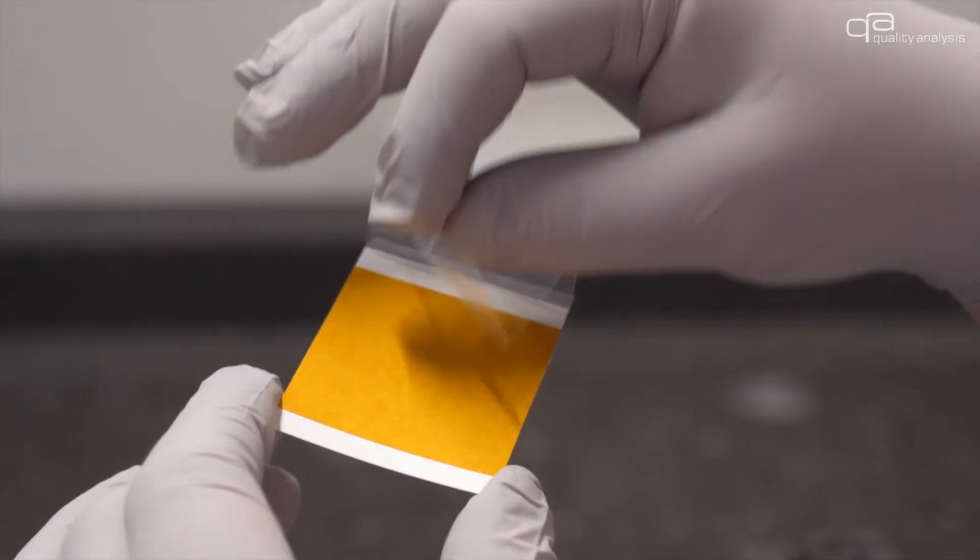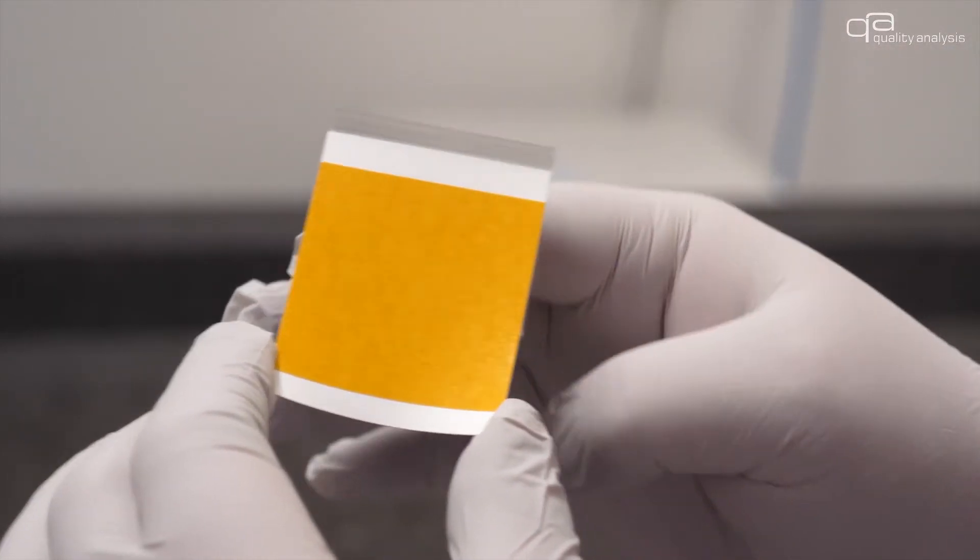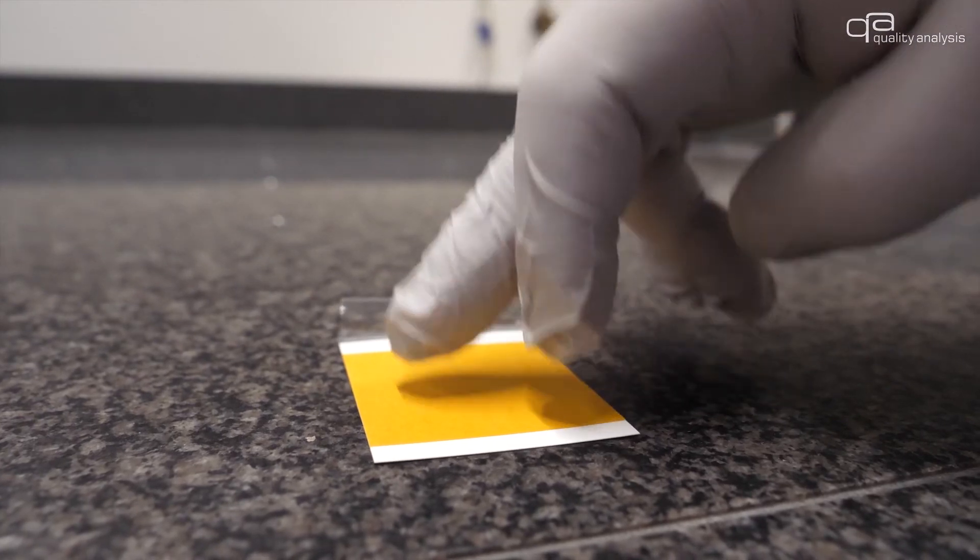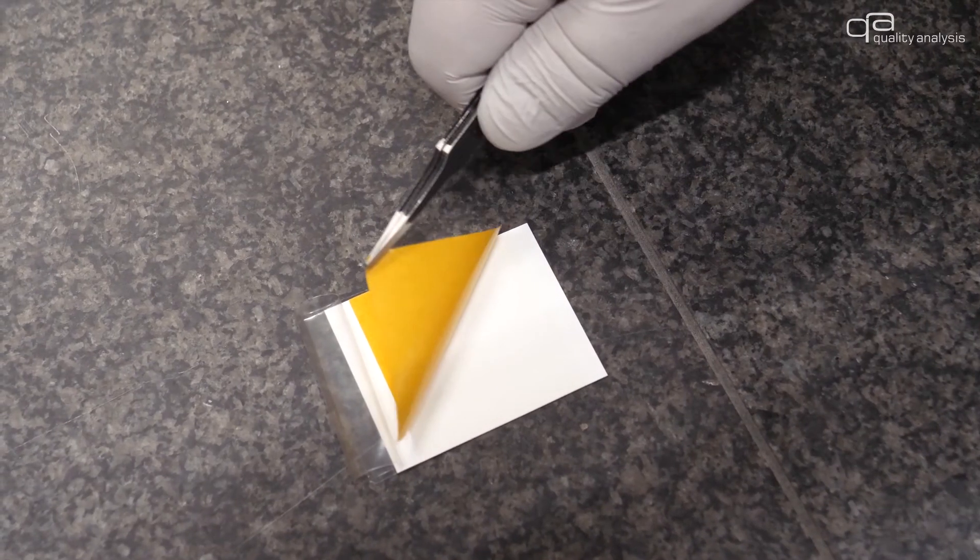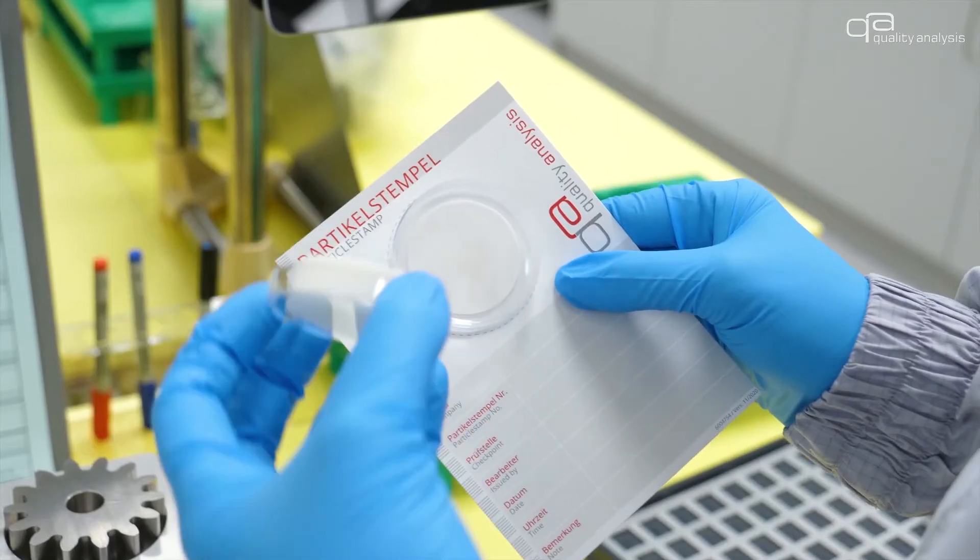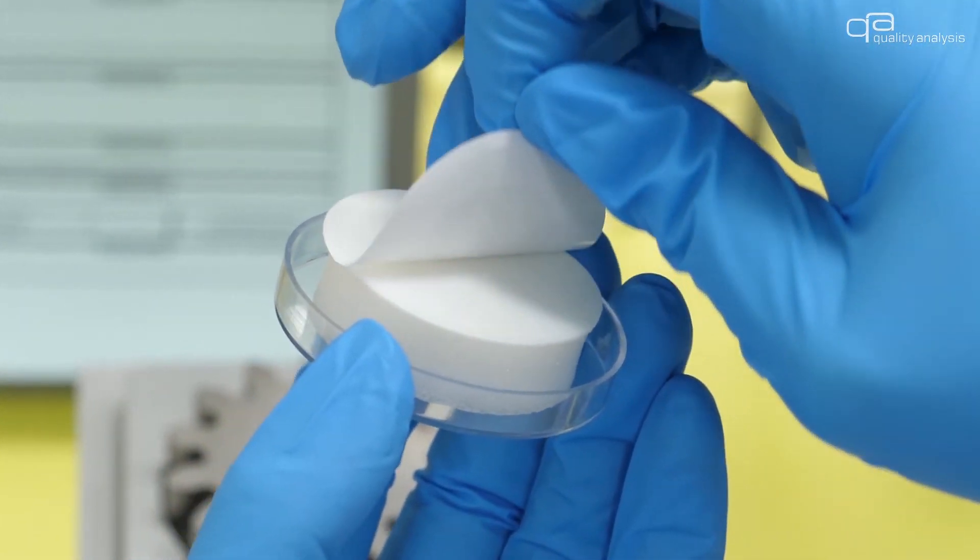Moreover, we offer a comprehensive portfolio of services such as environmental monitoring of processes and production sites by means of particle traps or testing of assembly cleanliness audits by means of particle stamps.